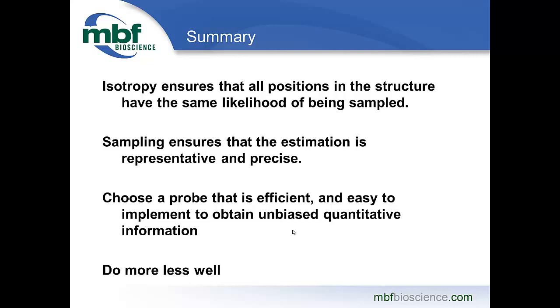Cell profiles, because it doesn't represent a unique point of your cell, means that you are not ensuring that you're going to count an object once and only once. Not only that, but that cell profile is going to have a bias depending upon the size of the object that you're looking for.